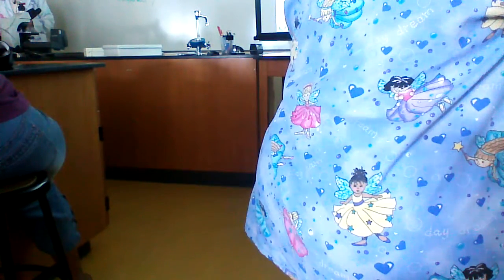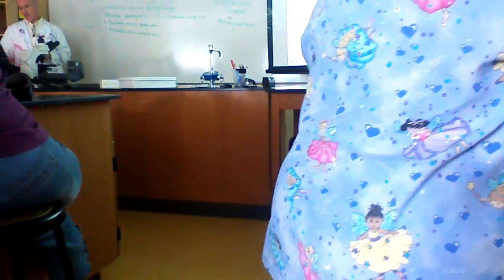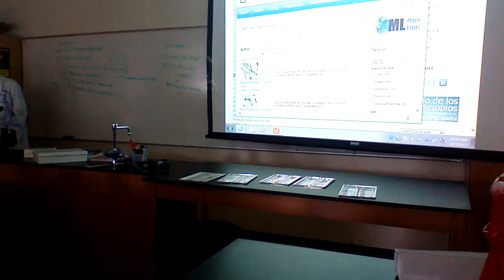Gram stain. So let's go look at a couple of these. Open that in a separate tab. There we go.